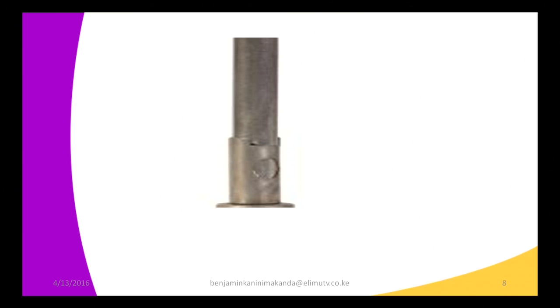Now moving on, what about this one here? Are you able to identify that part of a Bunsen burner? From the overview of the Bunsen burner, which part is this? Do you identify this as a chimney? Then you are right. This is the chimney of a Bunsen burner. And what's the chimney? It's a hollow metallic cylinder with an air hole near its lower end.